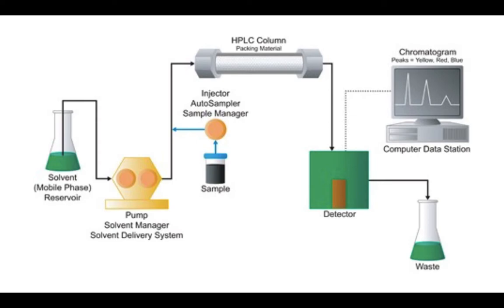In HPLC, the stationary phase is a solid, using silica or alumina, and the mobile phase is a liquid. The competition between the stationary and mobile phases pulling at the components is what drives the separation. HPLC works with very small quantities and contains a very sensitive detector.